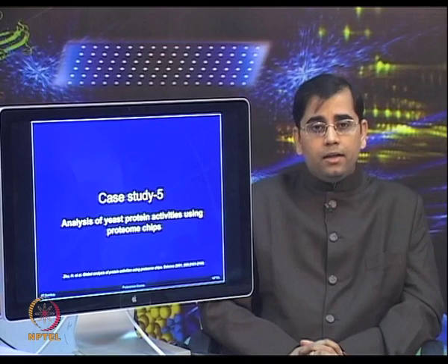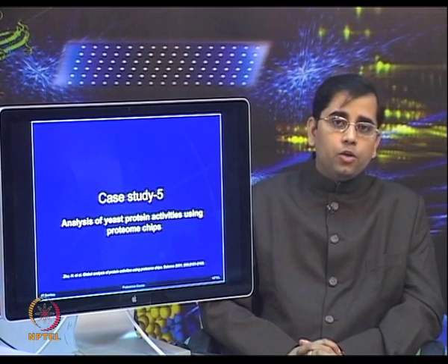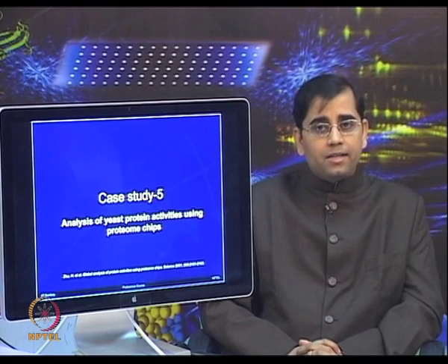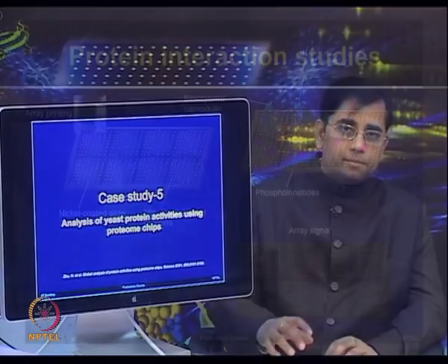Let us now discuss case study 5, analysis of yeast protein activities using proteome chips. In this study, Zhu et al. cloned 5800 open reading frames from yeast and overexpressed and purified these proteins to build the yeast proteome microarrays.